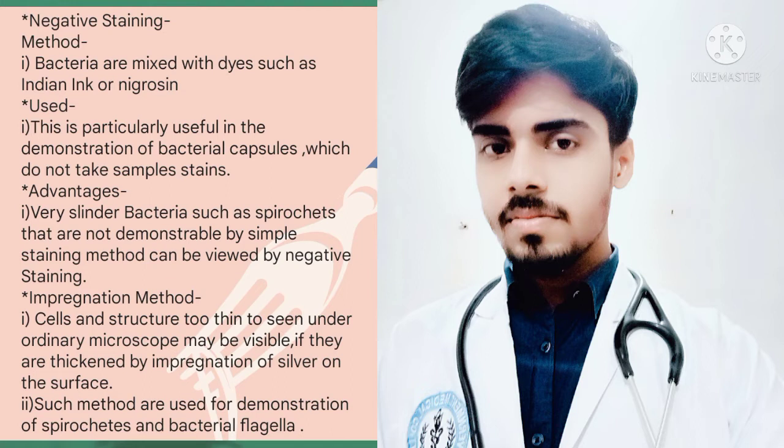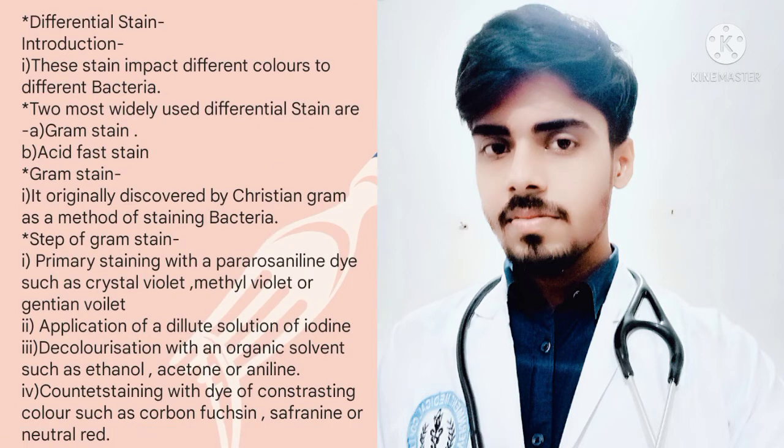This covers the different methods of staining bacteria. Now we will discuss the different types of staining. In introduction, you should remember that differential staining imparts different colors to different bacteria. The two most widely used differential staining methods are Gram staining and acid-fast staining.